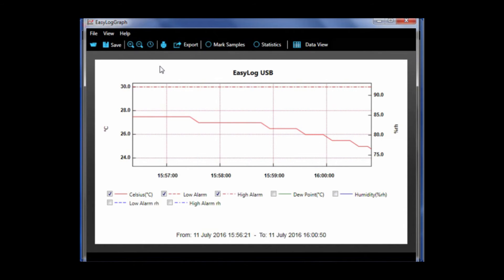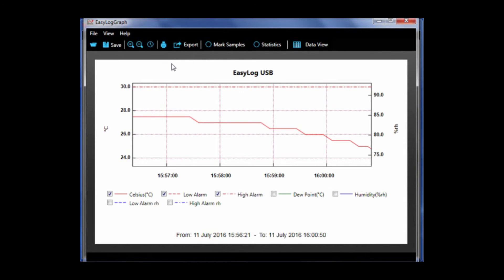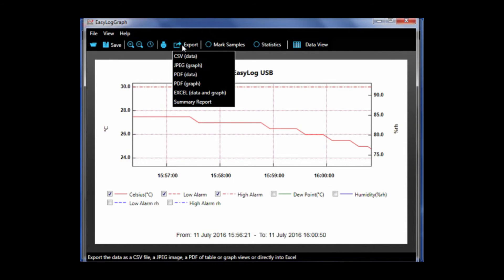To the right is a print icon which allows you to print the current graph view.